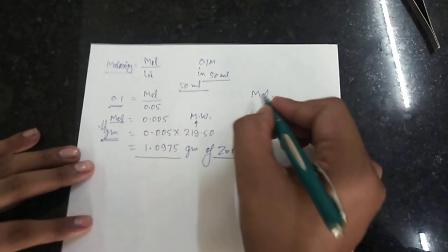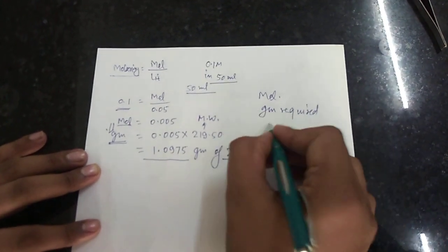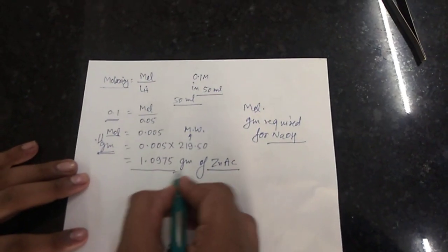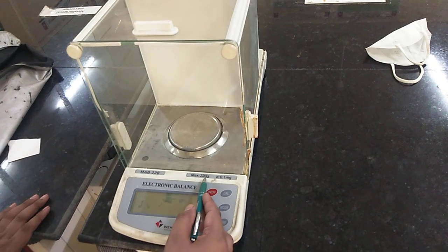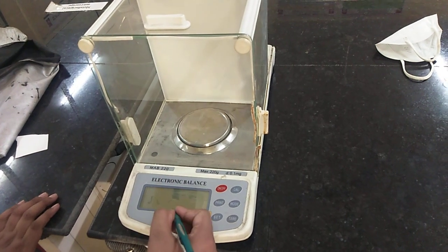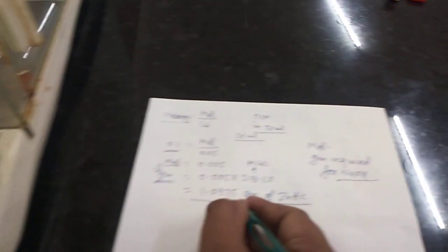Similarly, we calculate the number of moles and grams required for the sodium hydroxide (NaOH) solution, converting it the same way. For weighing, I am using this weighing machine, which is very accurate — it can measure a maximum of 220 grams and a minimum of 0.1 milligrams, giving readings up to four decimal places. Our calculation of 1.0975 grams matches this precision.